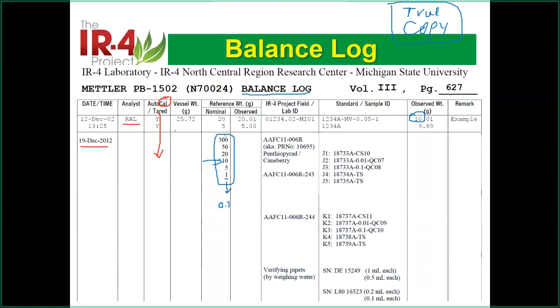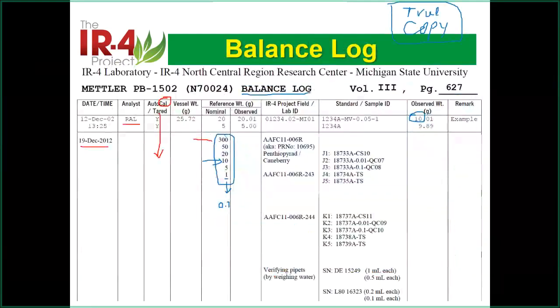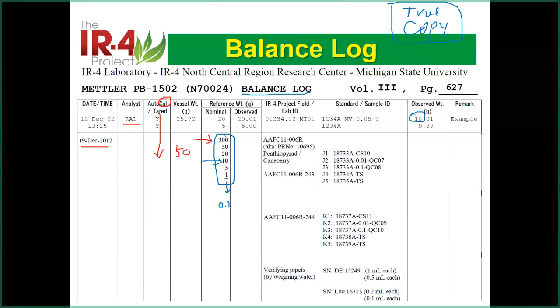Then you're going to say, okay, how heavy your bottle is. Remember we were doing the bottle thing? So how heavy this bottle is. You don't want to go over. If this bottle is 500 grams, then you need to have something 500 grams here. If the bottle is only 50 grams, for example, you need to write this down, plus your sample 10 grams. So you need to get something at least more than 100, to cover the range. And this is a good practice, to cover all the range you need. So both the glassware won't be greater than 300 grams. So that's good enough.